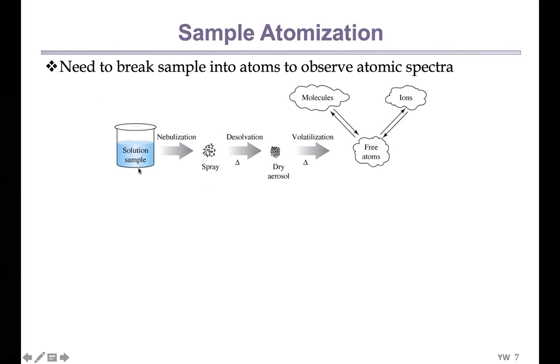We have the original sample. It will go through nebulization first to be converted to spray, and then it will go through desolvation to remove the solvent. They will become dry aerosols, and then volatilization to form free atoms. Okay.